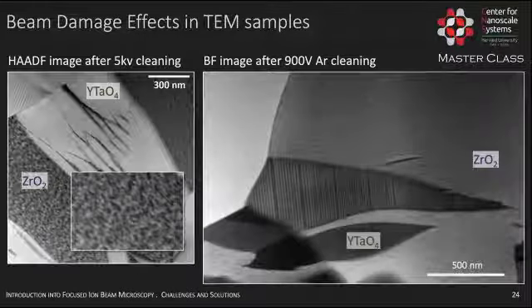When we do electron microscopy, we first have to overcome the problem that we are operating in a vacuum, and there are two major approaches to solve this problem. The process that has been used for many decades is dehydration and staining.